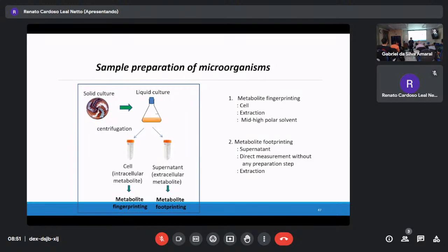Of course, some people say that if I extract with acid or a non-polar solvent, then probably only the metabolites leach out and we can detect them. But the problem is, agar is always there. When you extract with water, agar is there. When you extract with acid, agar still leaches out. Of course, in mass spectrometry, agar is probably not very well ionized, but it is still a problem with column chromatography, where the agar signal is very big. So there's an issue of how to remove the agar.